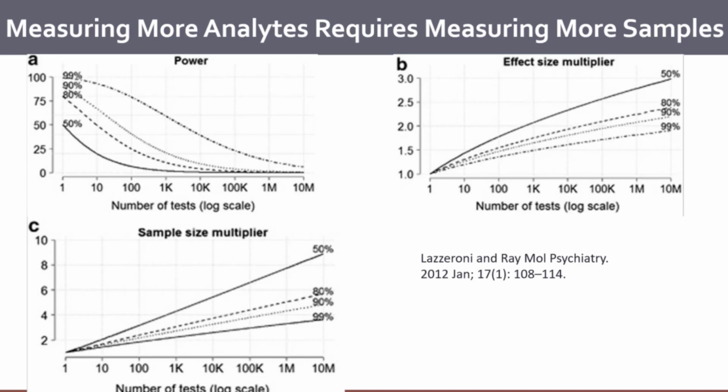People want methods that measure more analytes, and I definitely feel like we need to be measuring analytes at lower abundance and more specific to certain pathways, either transcription factors or kinases or other regulatory enzymes that people are interested in. But I'm not sure that we should be making very large lists of imprecisely measured data, right? So again, there's how many things you can detect versus how many things you can quantify, and then ultimately how many things you're quantifying and how that's going to affect your power.